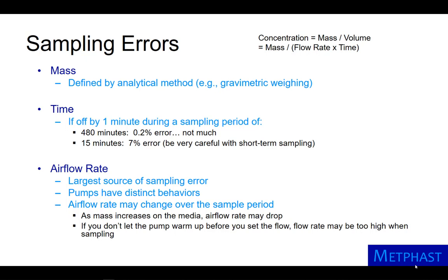The airflow rate is often the largest source of sampling error. Air sampling pumps have distinct behavior that one needs to become familiar with. Also, airflow rate may change over the sampling period. As mass on the collection media increases, airflow rate may drop.